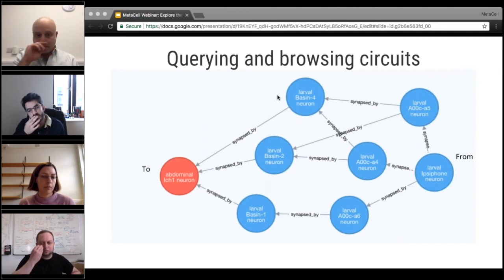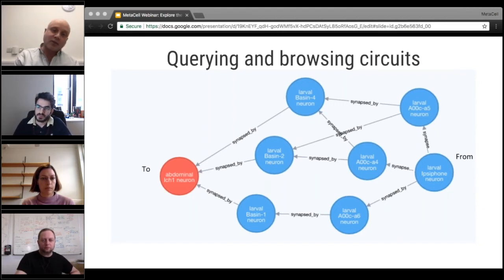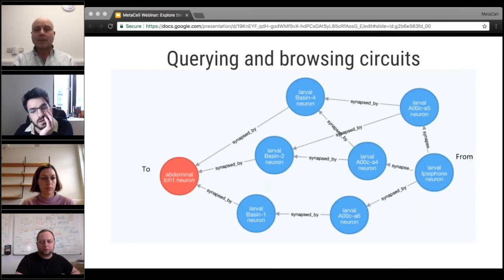So we know that this is a sensory neuron because of the semantics, so that's layered on as an annotation in color. And through this gives, I think, a way to very rapidly go between connectomics data, information about drivers, images of neurons, expression data, etc. Okay, so I think that kind of summarizes where we're going with that.